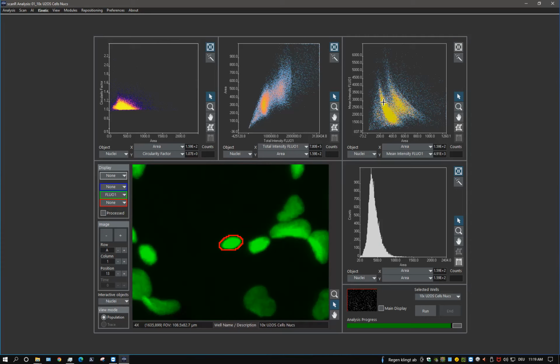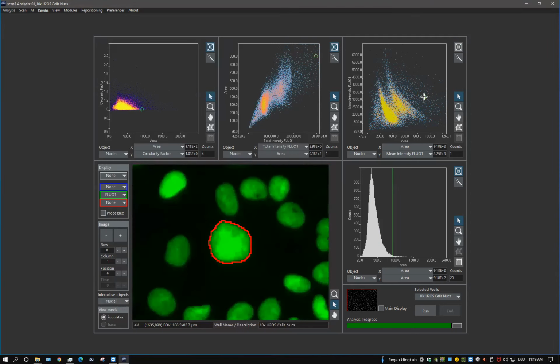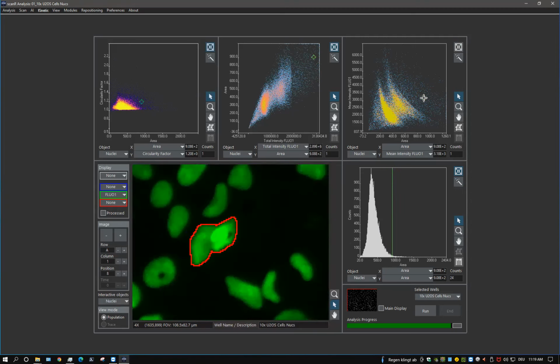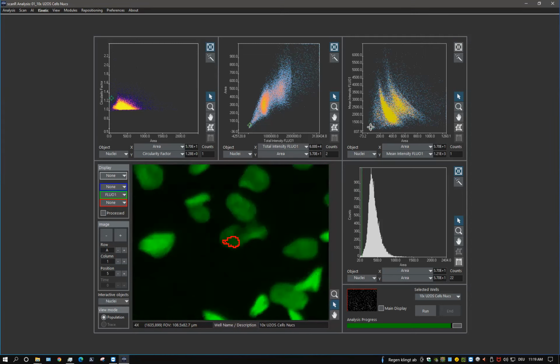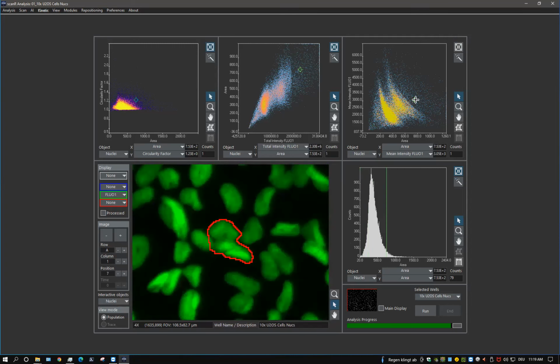But in addition to the two clusters, I also see objects outside the clusters. These are, for example, the very big objects here. These are typically double detections, like this one here, and some nuclei which have a strange shape for whatever reason of preparation or biological reasons. And I see very small ones. They're typically false detections because the detection is not perfect. But in general, this does not matter too much because I have so many valid objects that this is well below 1%, maybe even much less, of false detections.